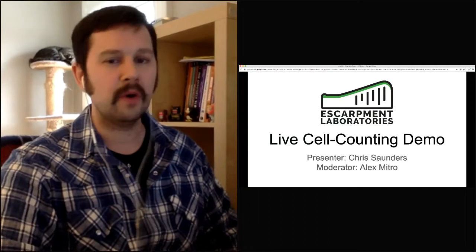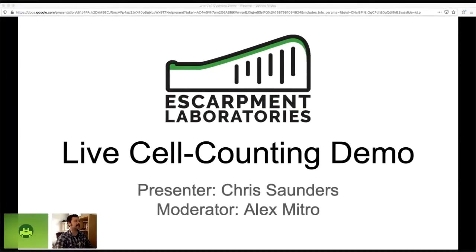Okay. So we're gonna talk about cell counts. Oh, hold on, I need to make it full screen, I need to focus that. All right, close that, maximize that. All right, sorry.